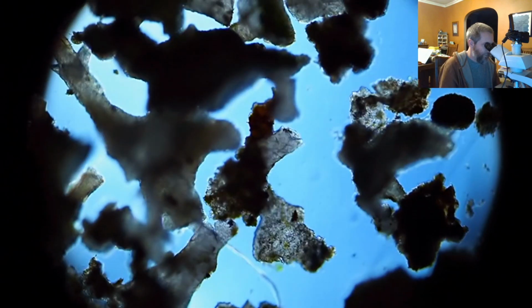I didn't think that they were dead, though, and the reason is that I ultimately decided to dry the slides back out, and when I dried the slides back out, oh, here's some more. There's a rotifer and another rotifer. We're in like a little rotifer village here. So they rolled back up into little balls after I dried them out. So I don't think they do that if they're dead.